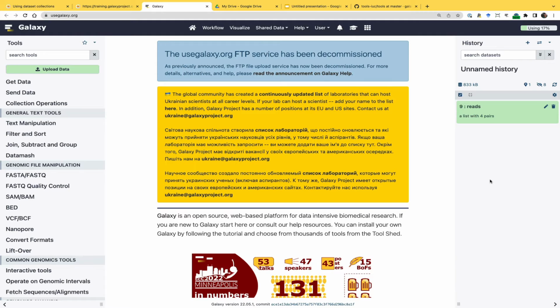Okay. And again, this is just a forward-reverse hierarchy, but you can have cases, controls, smoking, non-smoking, males, females, whatever. But in this case, we have this paired hierarchy. So that's a collection. That's just one thing we're going to have to deal with. In this case, it has 4 pairs, but we have had collections, for example, when we were doing COVID analysis with tens of thousands of samples, but they all look the same, just one thing. So you can download out of the SRA database.